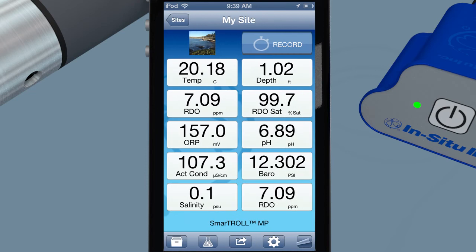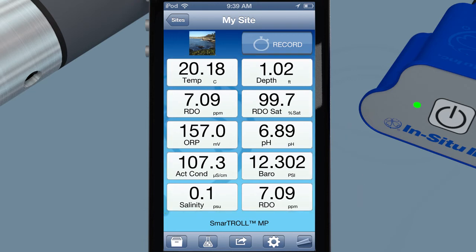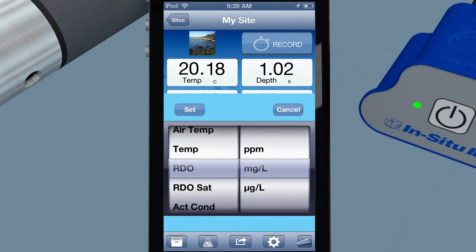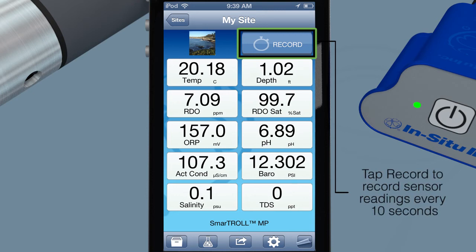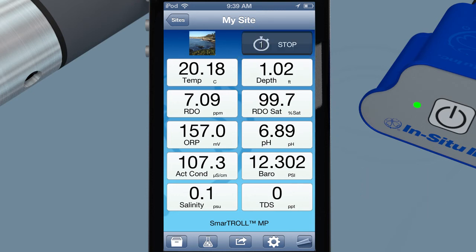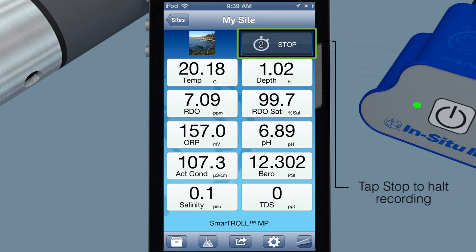View live readings for 10 parameters at a time. Easily change any parameter or parameter units with the flick of a finger. Record data in 10-second intervals with the tap of a button. On-screen indicators clearly display your measurement time. Data logs record all 14 available parameters. Stop logs at any time by tapping a button.